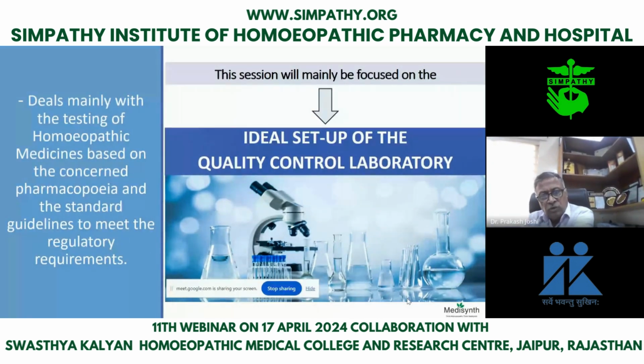As I told you, how to set up an ideal laboratory. The purpose is, first of all, you have to find out what we want to do, whether we want to have a quality control laboratory, a quality assurance laboratory, or a laboratory for food. Here we are restricting ourselves to the laboratory related to homeopathic pharmacy. When we say homeopathic pharmacy and laboratory, it means we have to have some standard. How are we testing the drug and any material? There should be some standard. So what are the standards?